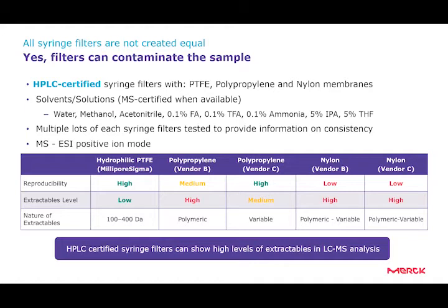We also looked at LC-MS because LC-MS is growing in popularity and use across industry as well as academia. And the majority of the HPLC certified syringe filters are certified by HPLC UV. So we looked at 3 different membrane filters: hydrophilic PTFE, polypropylene, and nylon membranes.